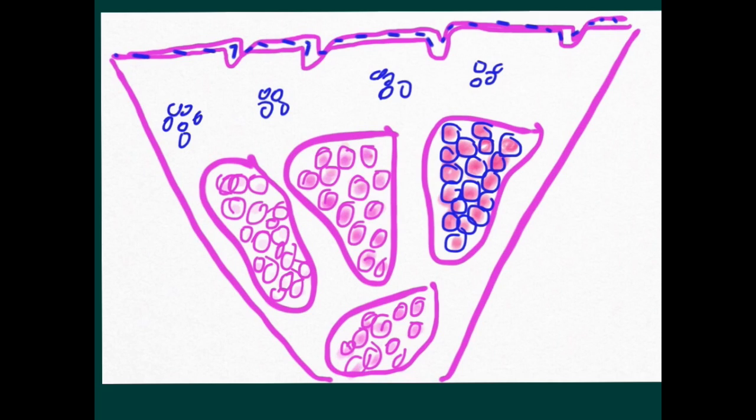view. The other slide among the organs covered by skin is the mammary gland, which is a lactating mammary gland, and you will notice that it is only a part of the mammary gland, just a sector, and the skin is very characteristic on the surface, on one surface, and not surrounding the whole structure.